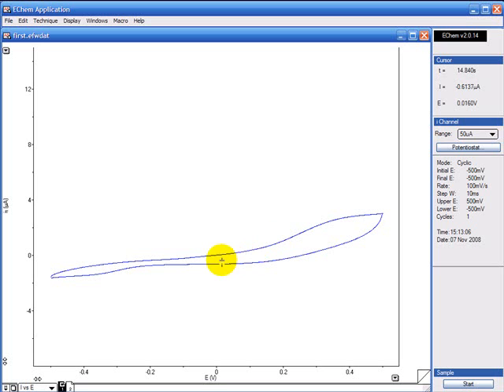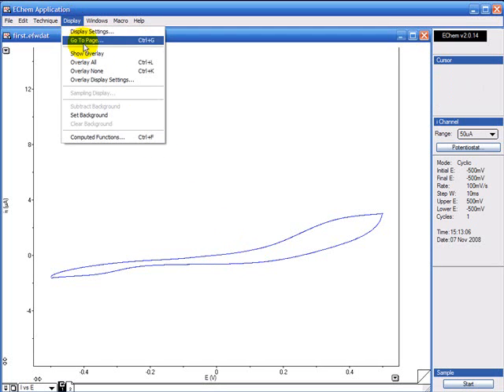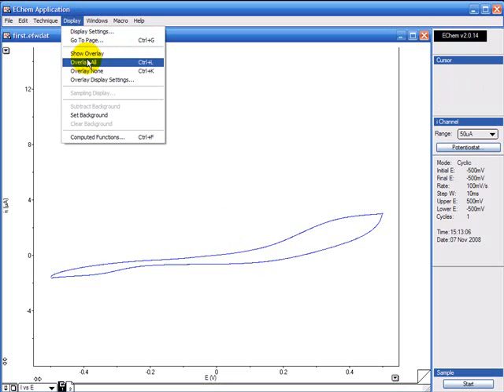I'm also going to show you how you can overlay the runs. If you go to display and overlay all.